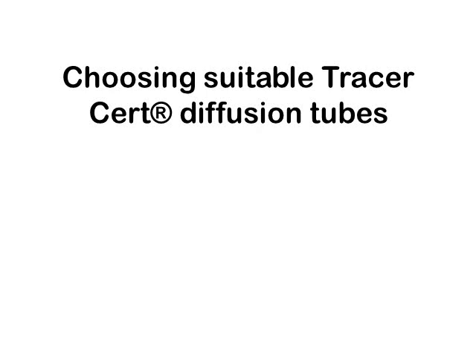So when trying to choose a suitable tube, we need to know what range of concentrations of the vapour is needed. It is best to use concentration units that are reliably calculated or estimated, and not subject to the confusion often found with ppm, ppb, etc. Examples of best practice would be nanograms or picograms per litre, nanomoles or picomoles per litre, and so on.